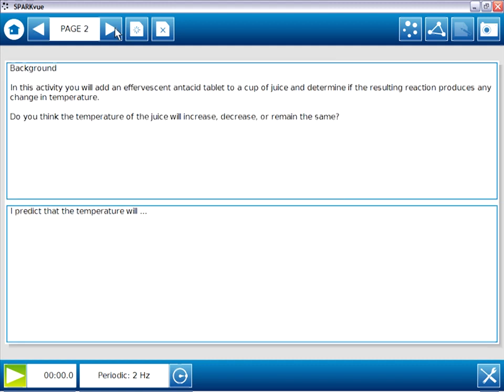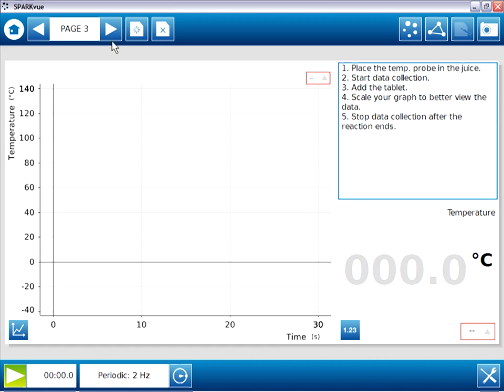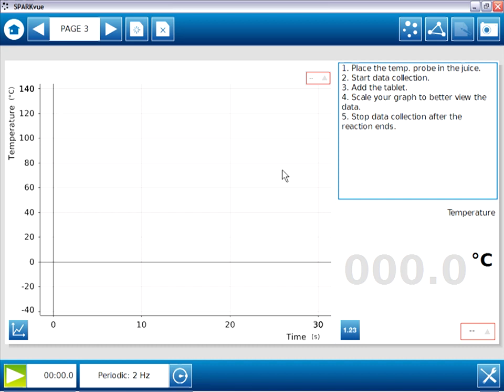Page two again has two page elements. This time it's two large text boxes, one in the top half and one in the bottom half of the page. On page three, we have three page elements. There is a small text box in the upper right and two data displays. There's a large graph of temperature versus time in the left two-thirds of the screen and a small digit display of temperature in the lower right.